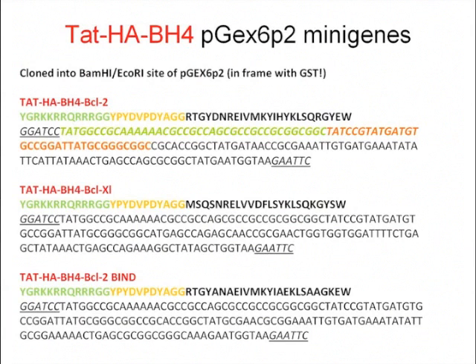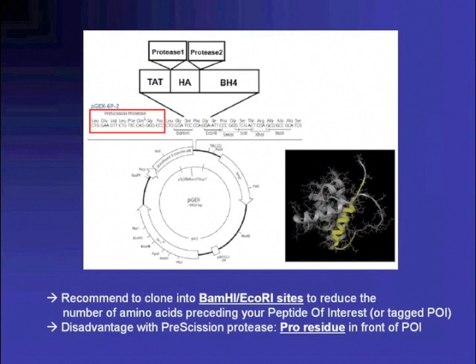On the other hand, you might have the option, if I may, you could design the pET vector with the His tag, and you could insert some linker sequences between your peptide of interest and your His tag. And between the linker sequence and your peptide of interest, you could introduce the protease site. So this means that you have the His tag for your purification, and after the purification, you might want to remove the His tag and the linker sequence just by using the protease. I think that would be an option in that case.